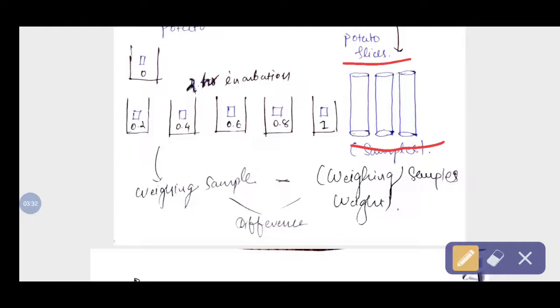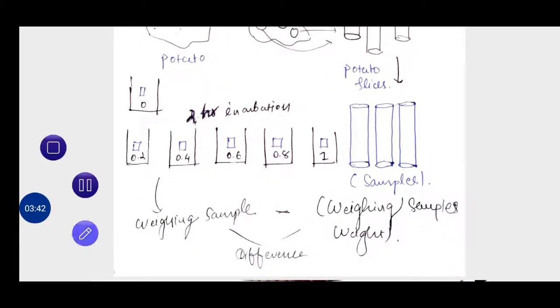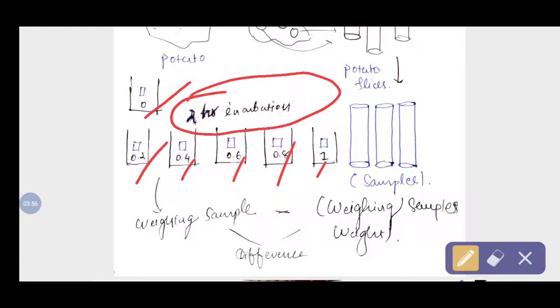We then place the slices into the previously prepared solutions: 0, 0.2, 0.4, 0.6, 0.8, and 1 molar sucrose solutions, and incubate them for 2 hours.